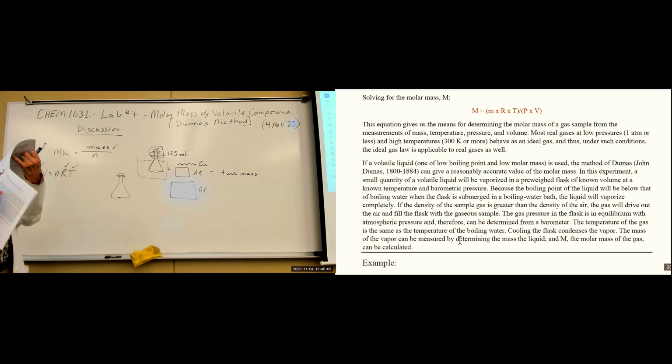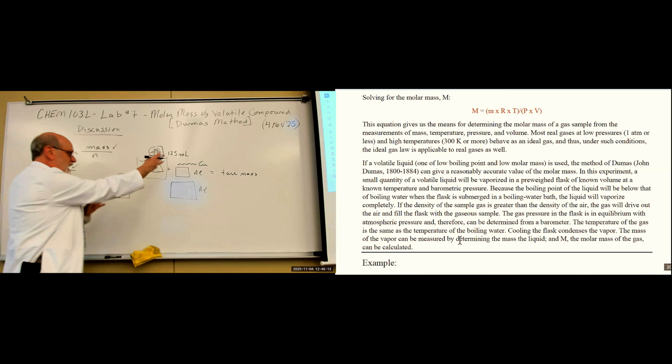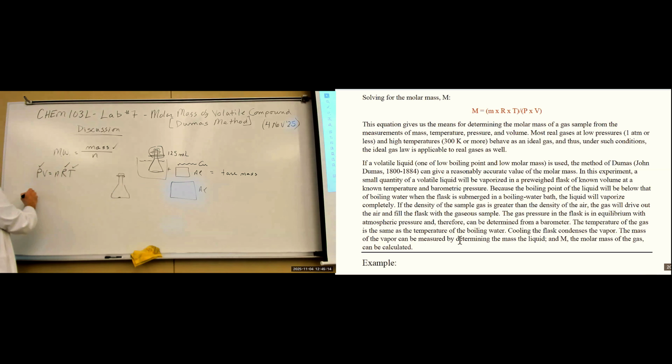And you look on this and find out what the temperature of the water is, and that tells you the density. So if you know the density of the water, and by subtraction you know the mass of the water, mass per unit volume, then we solve for volume: the mass of the water divided by its density at that temperature, and we've got the volume.